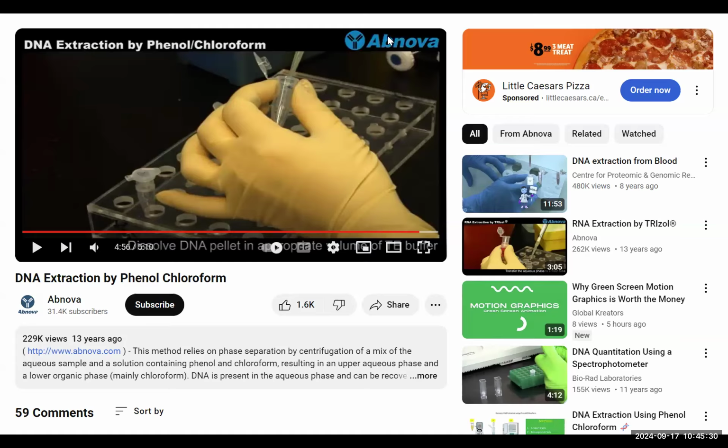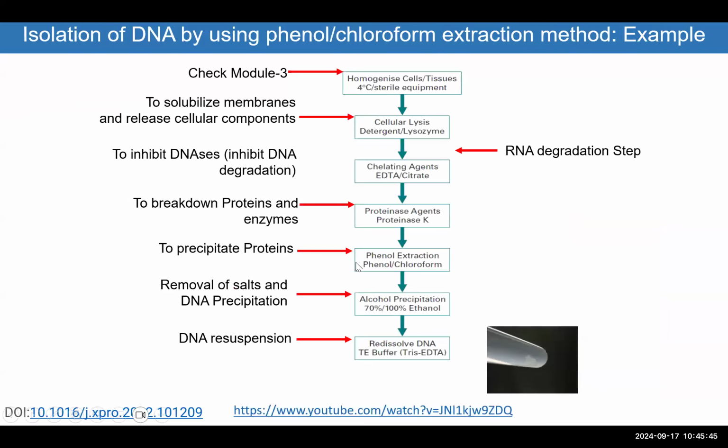Okay, so let me stop sharing this and go back to that. Okay, so in case you run into a lab, most of the time you will see protocols that you get from companies which would sell you the phenol chloroform.